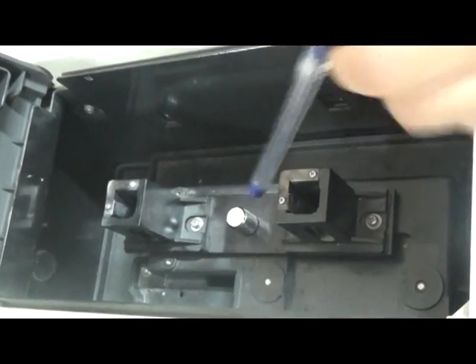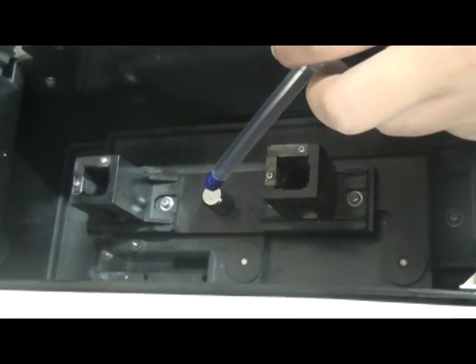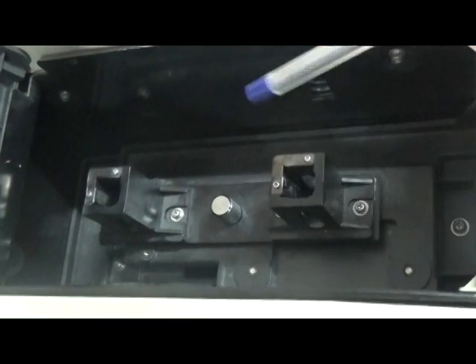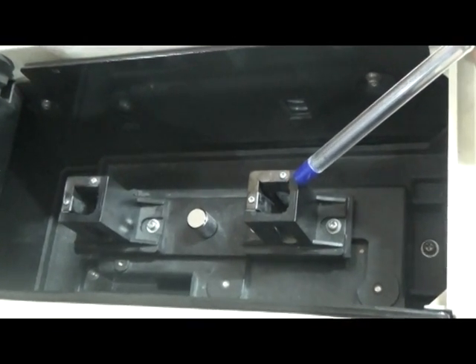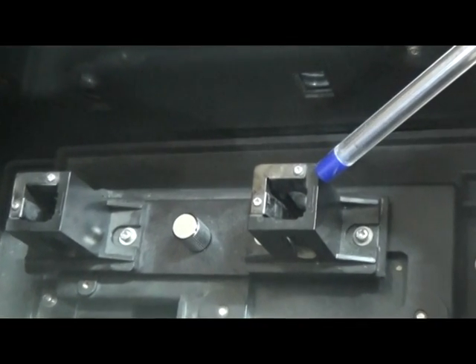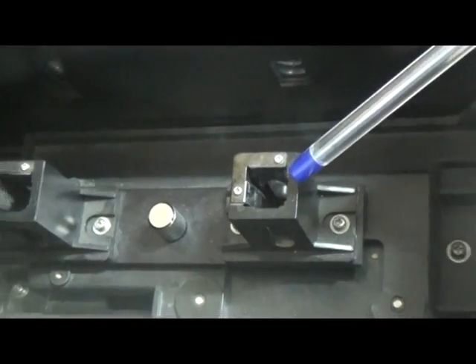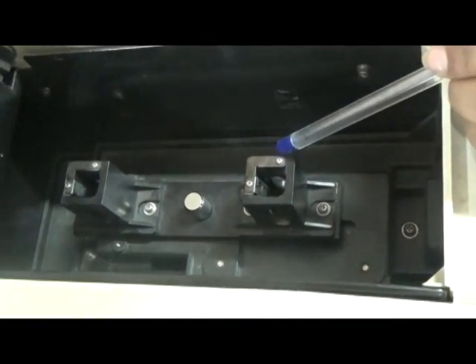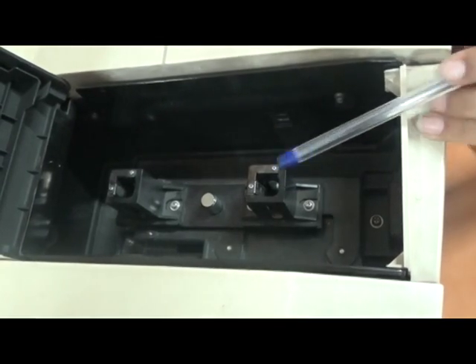This is called the cell holder set screw. The cell holder can be easily removed by loosening the cell holder set screw. This is called the cover sample compartment. When using a flow cell etc., holes are needed to pass tubing etc. through. Therefore, this cover sample compartment can be removed and exchanged with a different type of front panel.